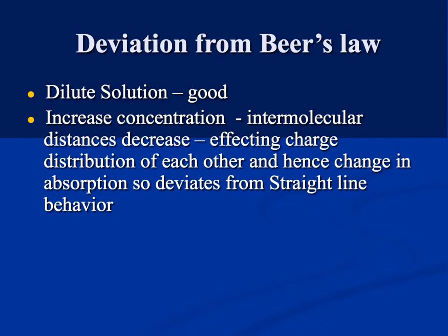You cannot just take a concentrated solution and put it in the cuvette and find out how much the concentration is. You saw that in our Biuret method or Lowry's method, that we had to bring it to a concentration of micrograms or milligrams per ml for the particular protein solution. It's true for all the other solutions, for vitamins, for metals, for any other reaction you are going to determine. These techniques are really sensitive to concentration, so you have to have a dilute solution.